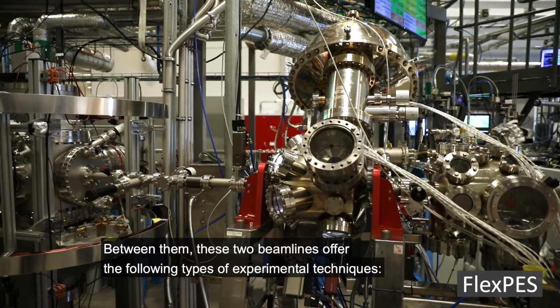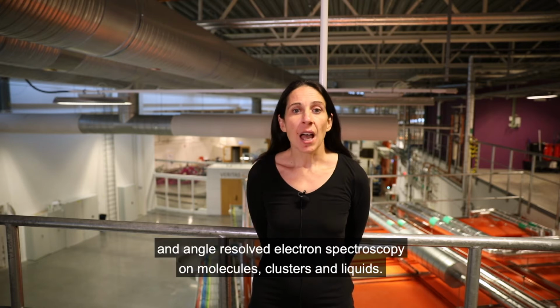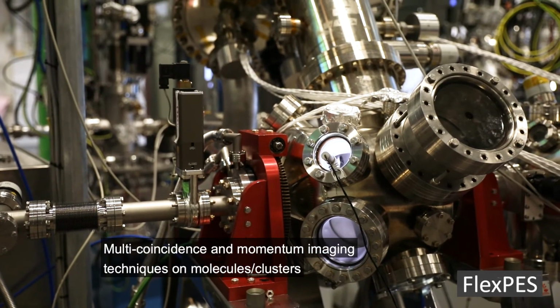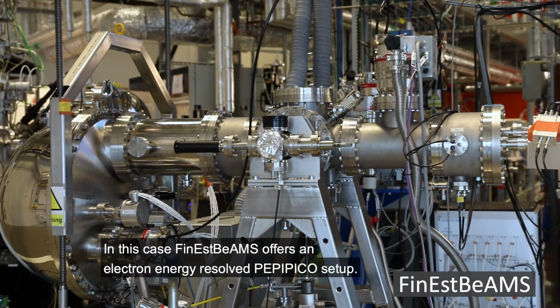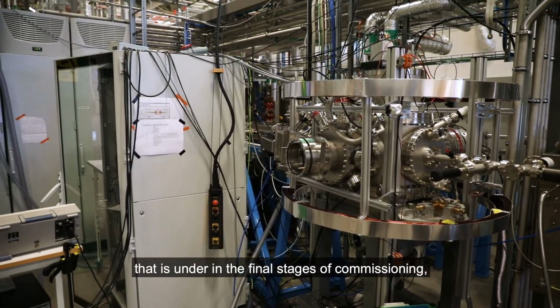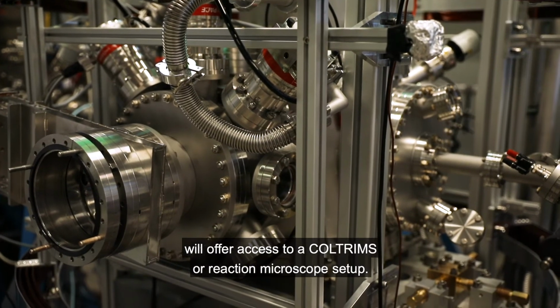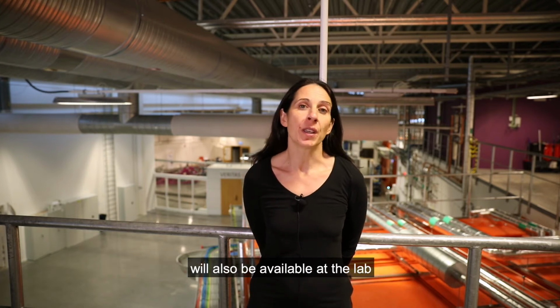Between them, these 2 beamlines offer the following types of experimental techniques: high-resolution photoelectron spectroscopy and angle-resolved electron spectroscopy on molecules, clusters and liquids, ion time-of-flight mass spectrometry on molecules and clusters, multi-coincidence and momentum imaging techniques on molecules and clusters. In this case, FinEstBeAMS offers an electron energy resolved PEPIPICO setup, and the ICE end station, a new mobile end station at MAX IV that is under the final stages of commissioning, will offer access to a COLTRIMS or a reaction microscope setup. Soon, negative ion, positive ion coincidence spectroscopy will also be available at the lab.